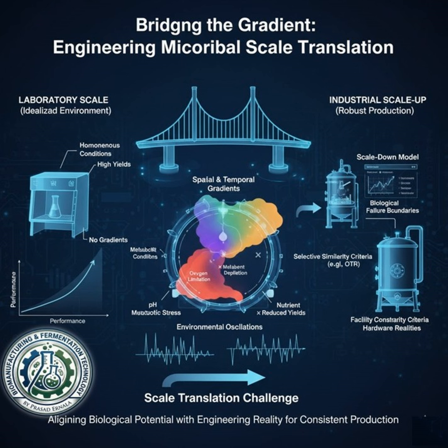Exactly. And the consequence of that cycling, the cell getting shuttled between a good zone and a bad zone, is devastating. Even if the average DO is fine, these oscillations trigger stress responses, what we call overflow metabolism. So the cell just stops making your product. It panics. It stops focusing on your product and starts making waste products like acetate.